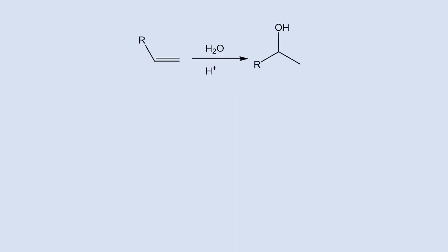The next reaction that you're going to perform this semester is the opposite of the dehydration that you have recently performed, and that is going to be the hydration of an alkene. The alkene in our experiment is going to be norbornene. Hopefully you have learned in lecture that when you hydrate an alkene, you get an alcohol product. And specifically here, we are doing an acid catalyzed hydration.